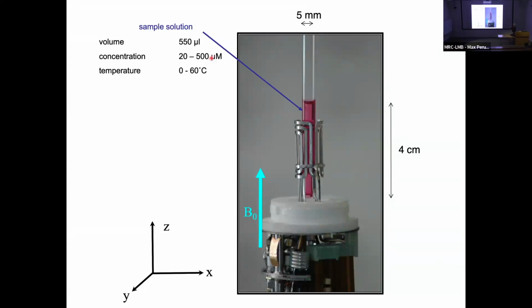So we're controlling the concentration very carefully. We have a fixed volume in this setup, and so we can't just load more and more sample in to get more and more signal, because we have to consider the problems associated with concentration of components in biological systems.